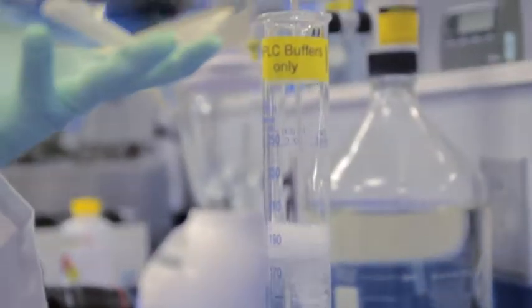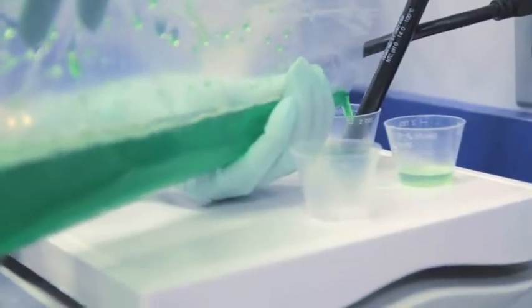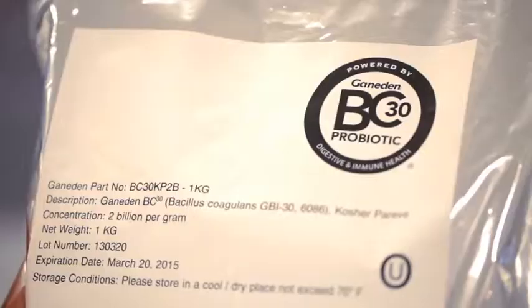Our team of scientists is constantly working to bring cutting-edge probiotic technologies to consumers worldwide through food, beverage, and skin care innovations. Most of our efforts are focused on our two branded, science-backed ingredients.